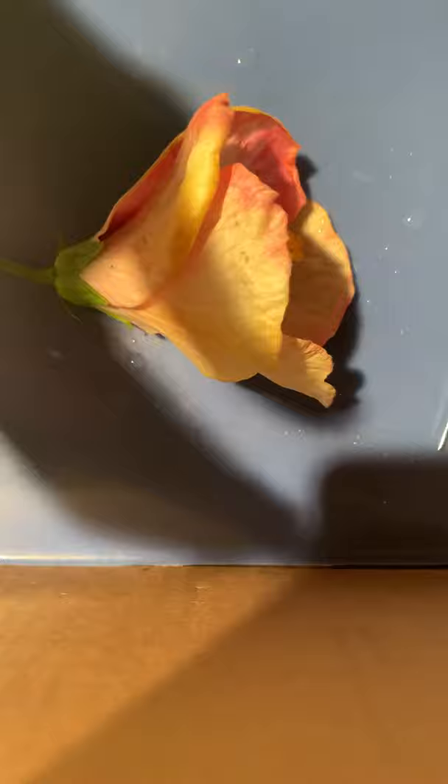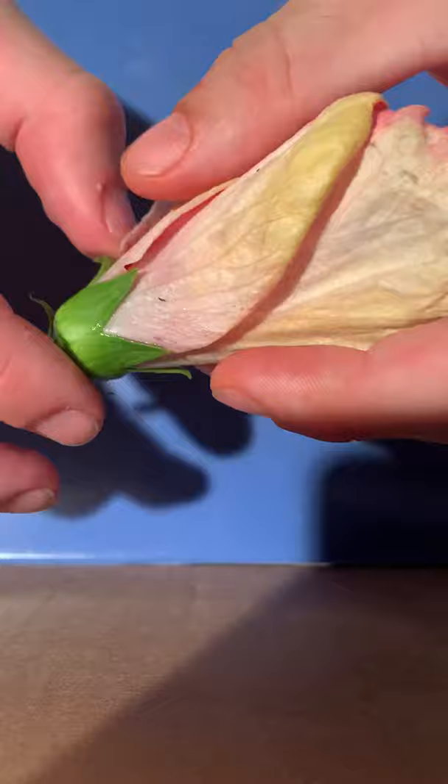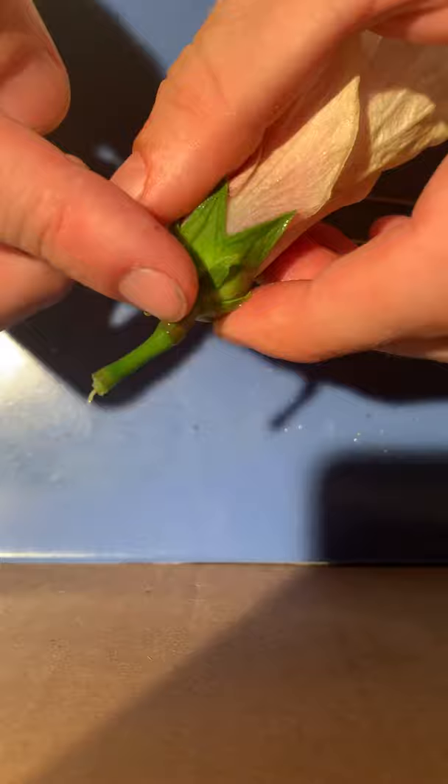Right here we have the flower itself. It is composed of petals which are around the outside, which help with pollination of a plant. This portion which kind of looks like leaves is called the sepal, which protects the flower buds. And right here is the stem, which transfers nutrients such as water up to the rest of the flower.